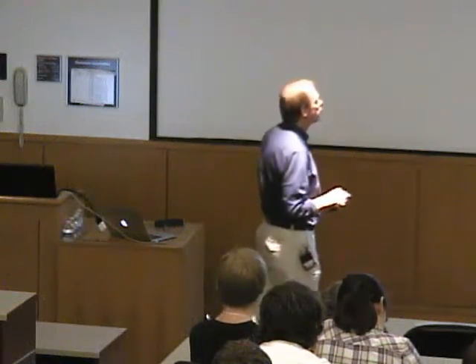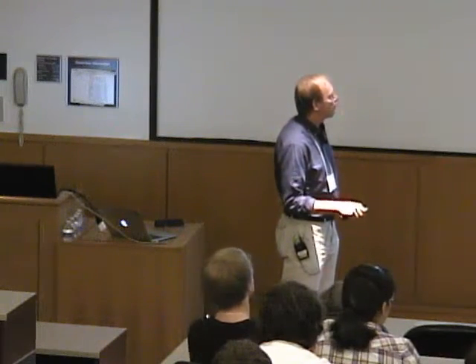So if we have 3 numbers, it's redundant. If we know that the sum has to be 0, I don't actually need 3 numbers; I can eliminate one of them. And so the zero field splitting is described in terms of 2 parameters, which are labeled D and E, and you can see we can write these 3 values in this way.